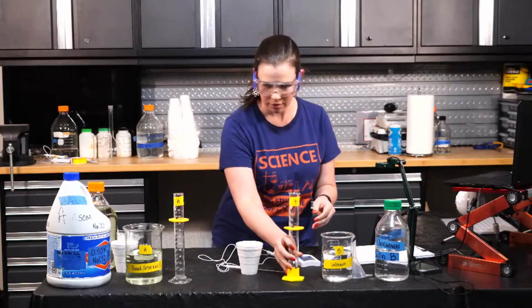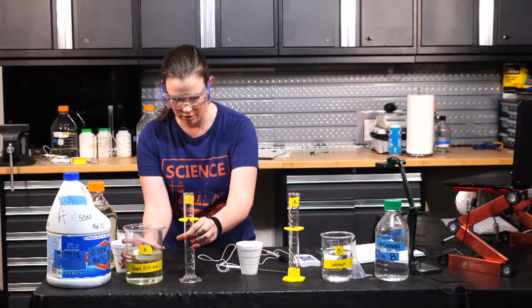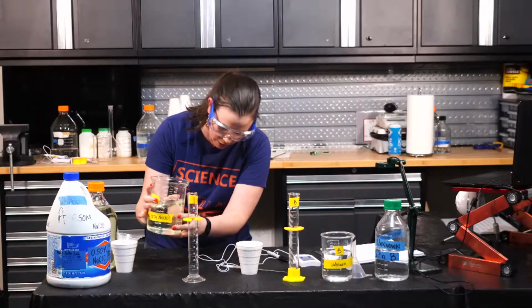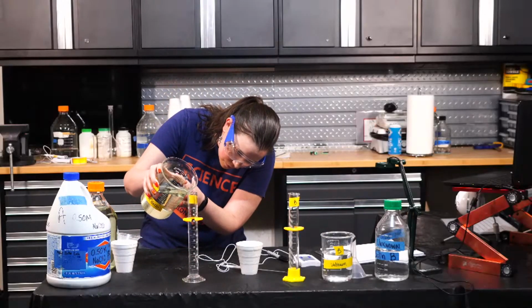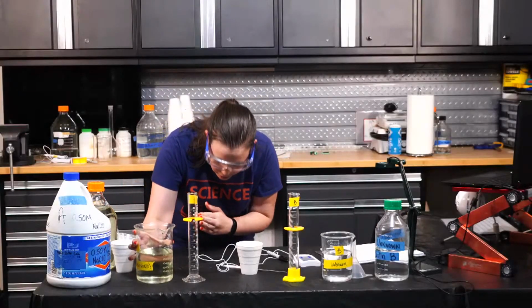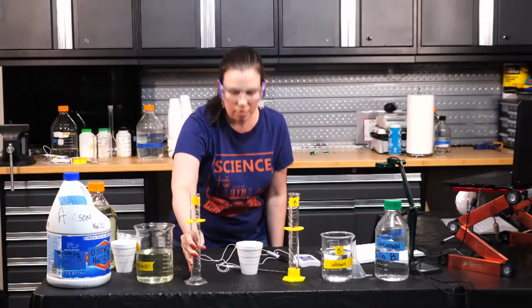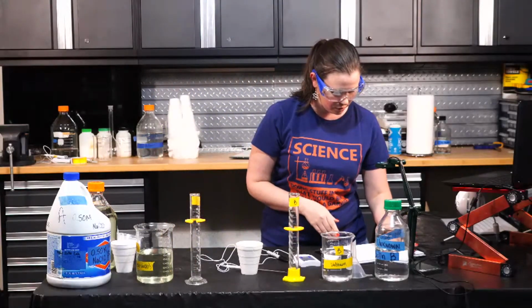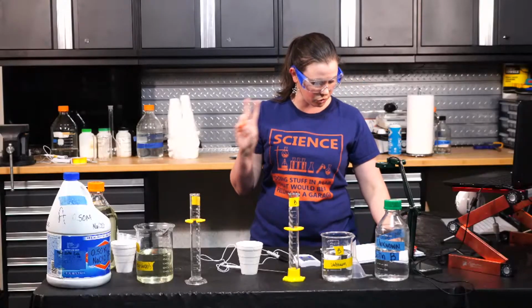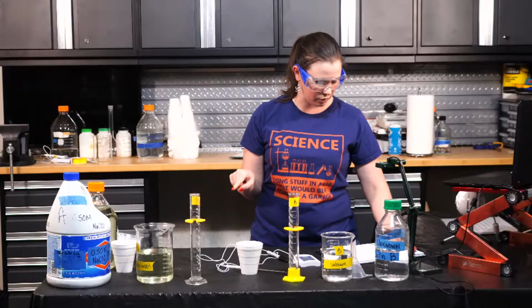We are going to start with, let's see here, this is solution B. So let's start over here with the bleach. 5 milliliters of solution A. Oh, you know what I just realized? I can't measure 5 milliliters in a 100 milliliter graduated cylinder. So timeout, or actually, let me skip to level 2, and I need to grab a different graduated cylinder for level 1.